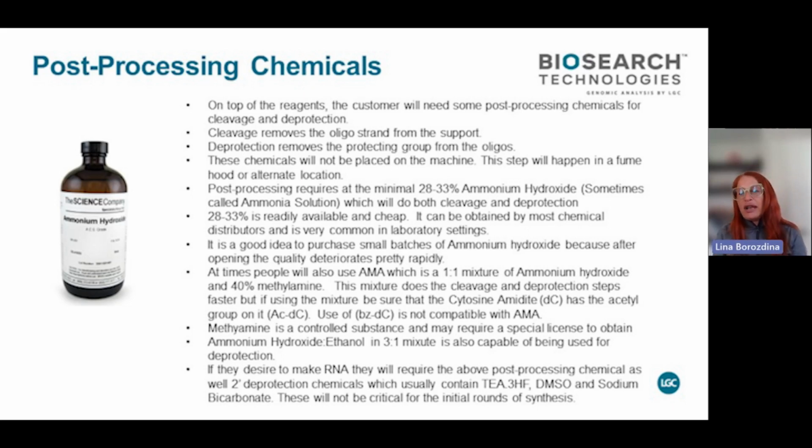And for RNA, there's also a secondary step if it's a traditional RNA, and it will have either TBDMS deprotection or different types of protection on the OH, then you will have to do it for the secondary step. And you need to keep your environment sterile after that, because OH is where the RNases will attack and eat your oligo, destroy it.